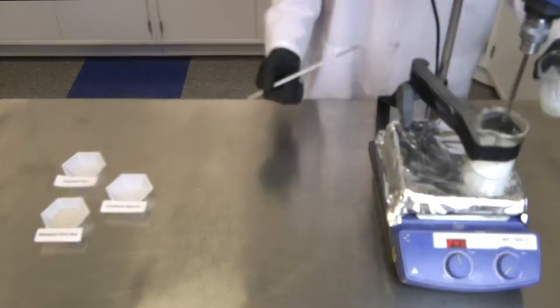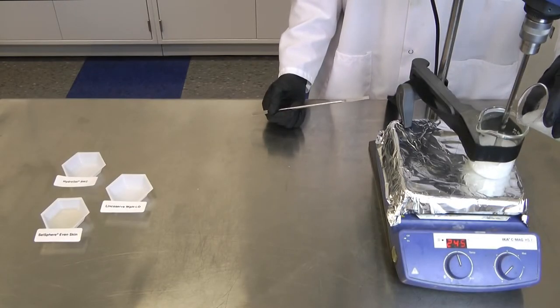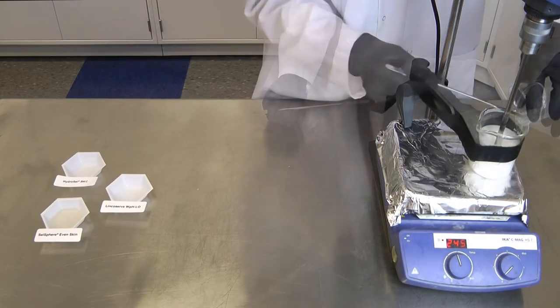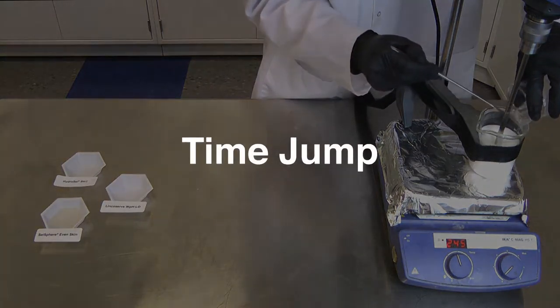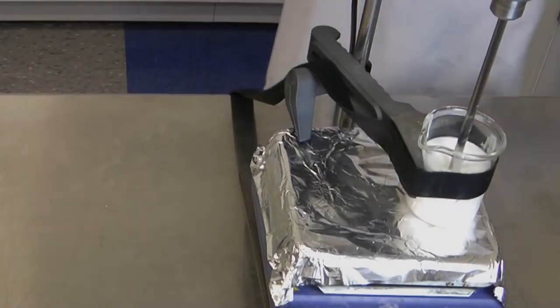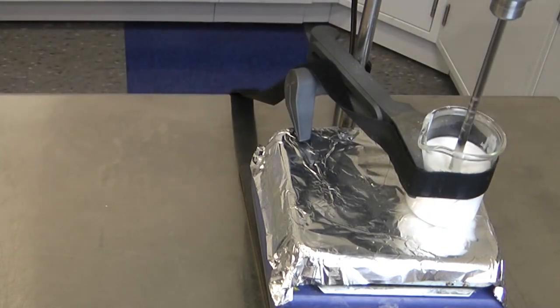Now that our oil phase and water phase are at temperature and both are completely uniform, we will begin to slowly add the oil to the water phase. Now that our oil and water phase are completely together, we will allow it to mix at temperature for about 10 to 15 minutes.